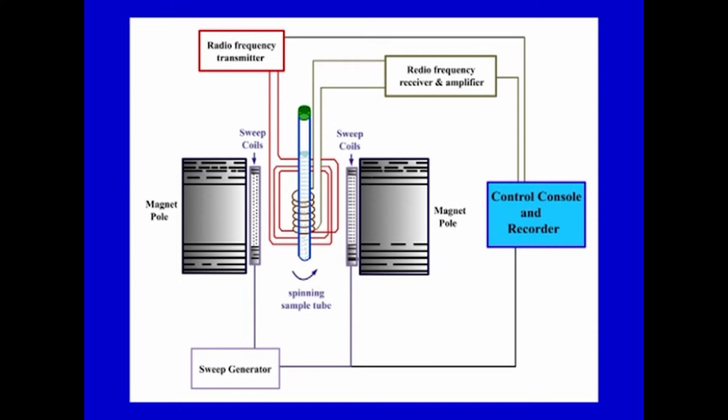At the correct resonant frequency or radio frequency, there will be a signal, which is the transition of nuclei from a lower state to a higher state, and the applied magnetic field is provided by this. Resonance will occur only when the frequency or the energy matches the two resonating states, and that particular spectrum will be collected and then analyzed as we have discussed.